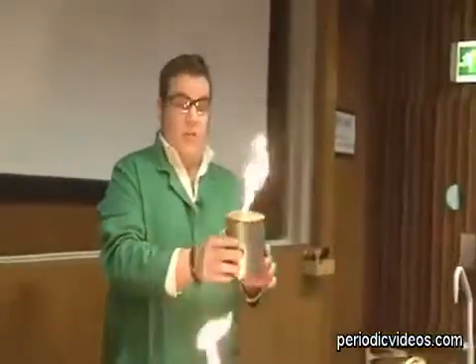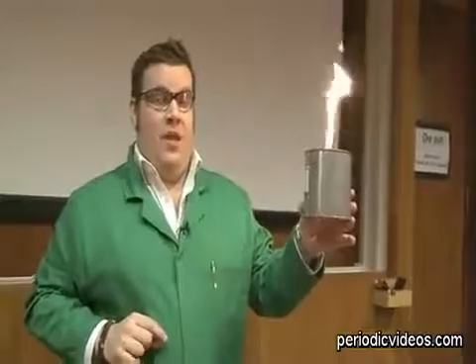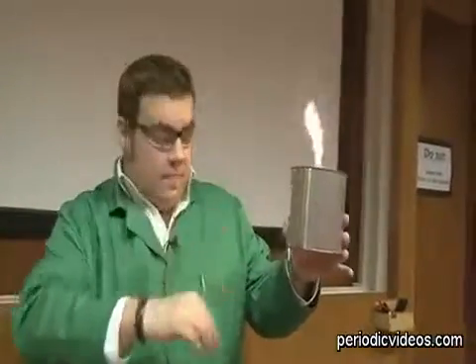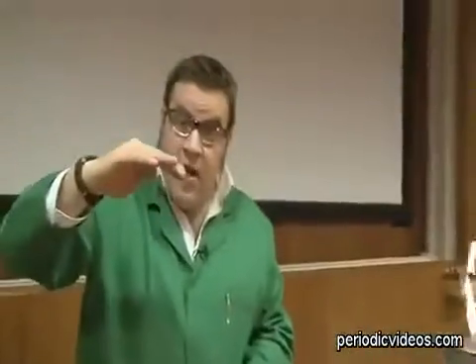So now I have a reservoir of gas inside my can, which is burning in the atmosphere. Okay? Now then, as we're using up the methane inside, something really cool is happening. Atmospheric air, including oxygen, is being sucked in through the hole in the bottom of the can. So as the methane is being used, more air is going in. So if we think about the can, the amount of methane is going down and the amount of air is going up. Eventually, they'll reach an explosive regime and something exciting might happen in the can.